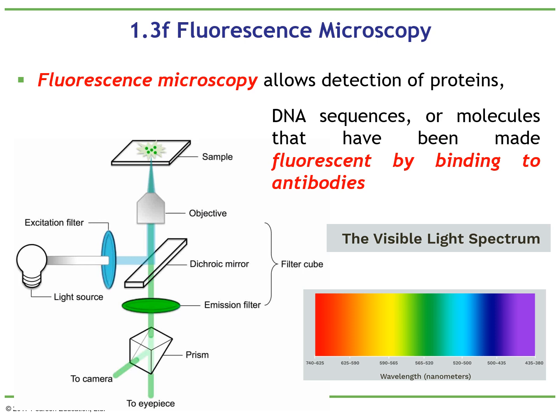Okay, so let's recap all the things that we have learned in this slide. You learned what fluorescence is. You know the importance of the absorption and the emission of light. Now you know how to apply that principle to a microscope, and you saw that a microscope generally can have the equipment for transmitted light, and in that way you locate the sample, but at the same time you can use fluorescent microscopy, and this is how our microscope works.